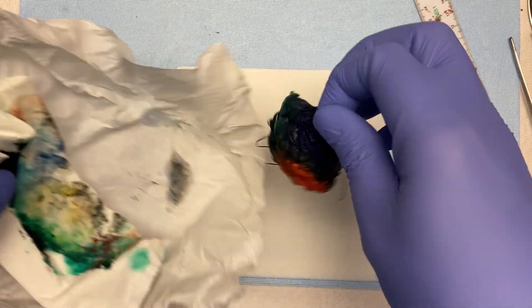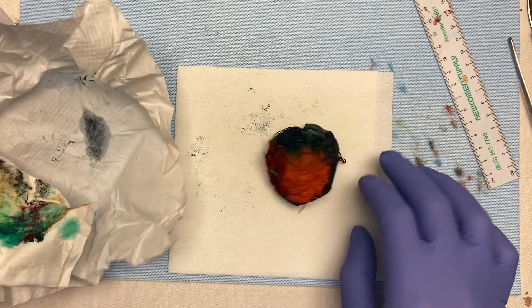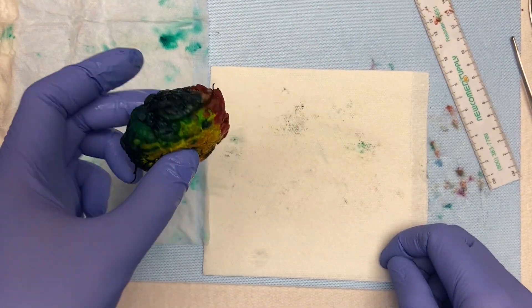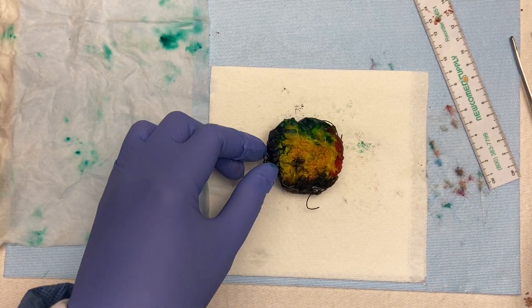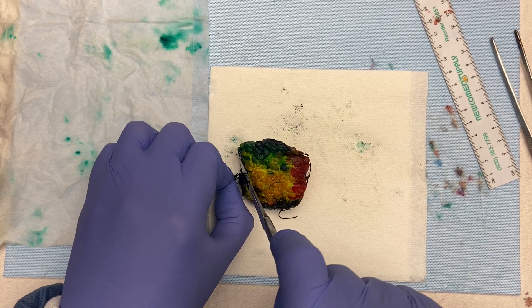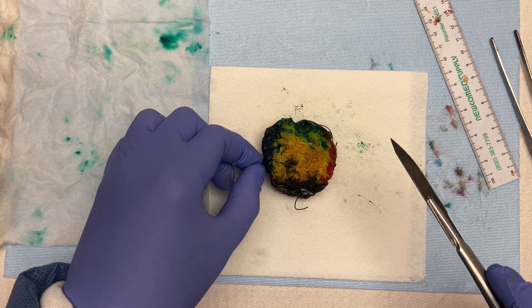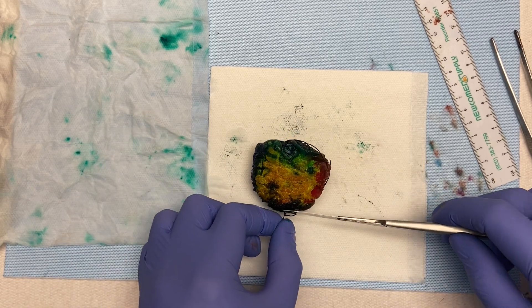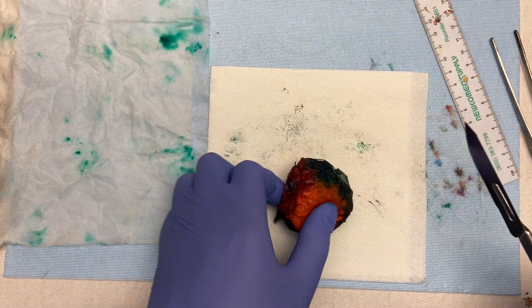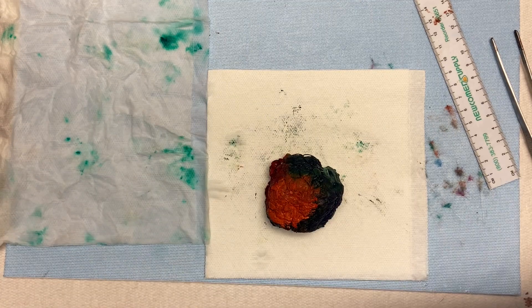There we have it — the specimen is completely inked everywhere. Now you can remove the tabs or stitches. Sometimes with stitches I'll just leave them, but if you leave these metal tabs and your blade hits one, it'll obviously dull your blade — so just get them out of the way. We've already inked it based on what the tabs indicated.